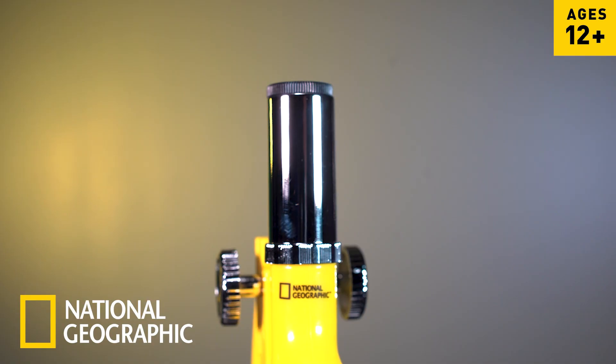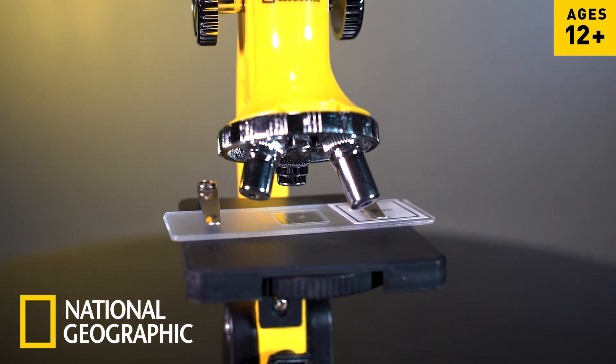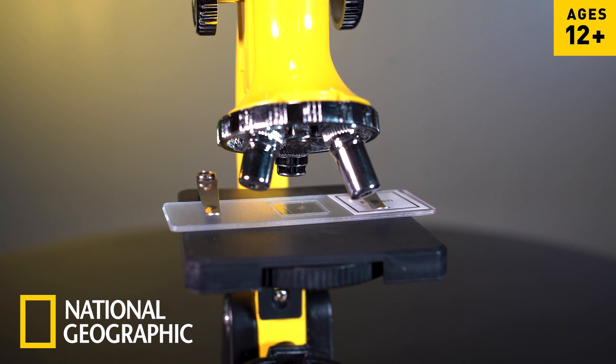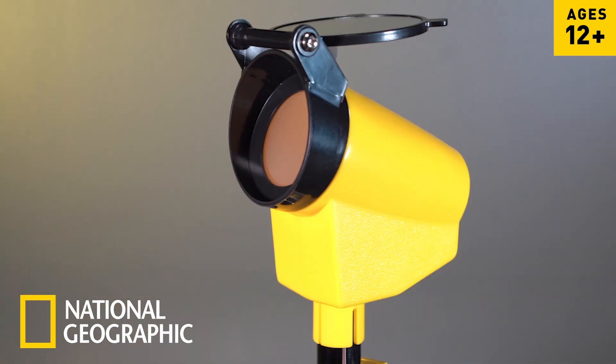The optics consist of a 20 times eyepiece and three objective lenses that combine to offer a versatile range of magnification from 300 to 1200 times. The set also includes a projection eyepiece that allows users to trace their images and provides the opportunity for multiple viewers to investigate the findings at the same time.